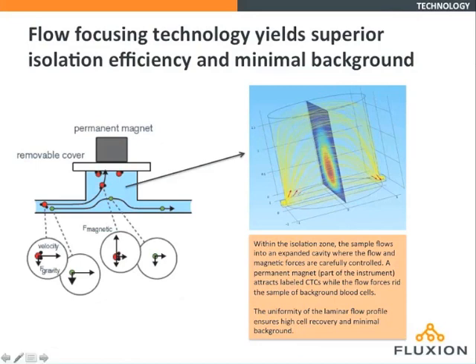What that does is the magnetic field gradients are high and highly focused, and the cells pass through almost single file through this separation region. Therefore, each cell sees similar forces as it passes through. And the capture is done by basically shifting the balance between the drag force that's due to the fluid flow and the magnetic force that's due to the attached beads.